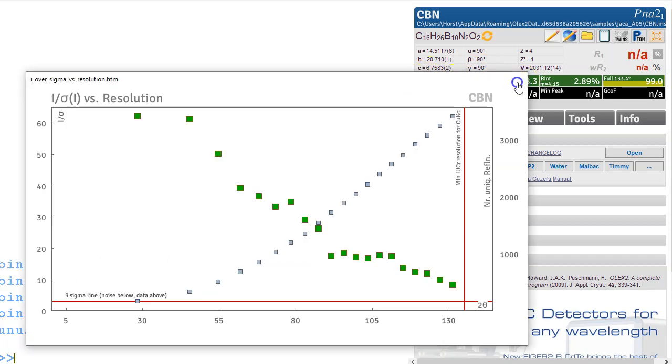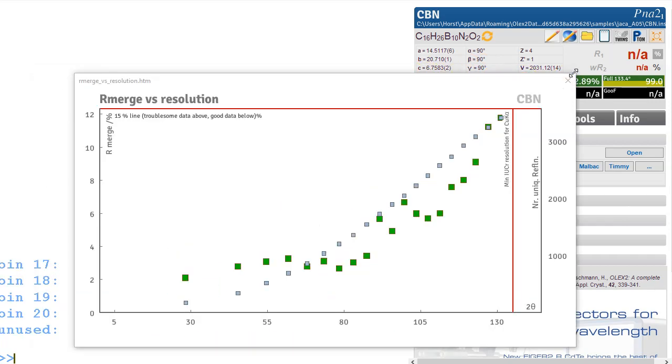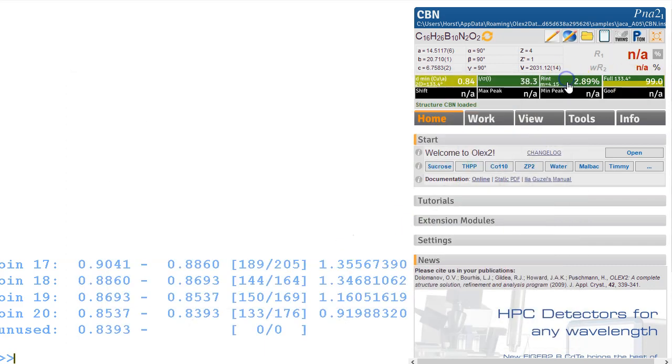Again we've got nice strong data, great Rint, so no problems expected.